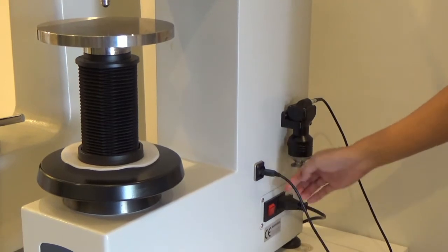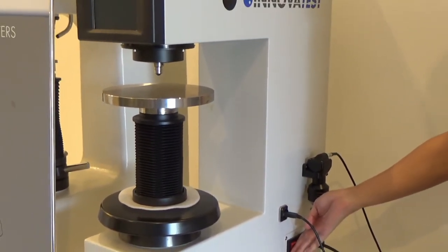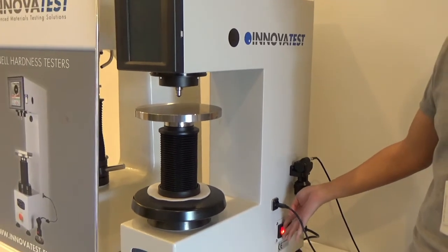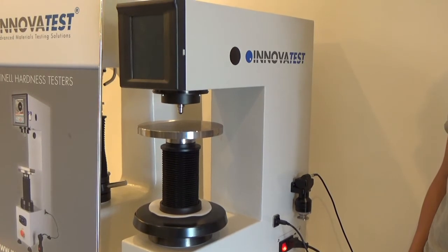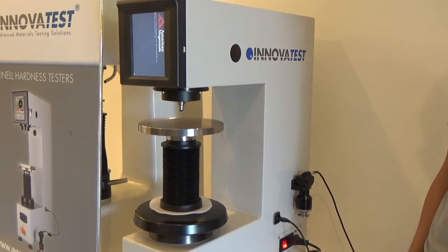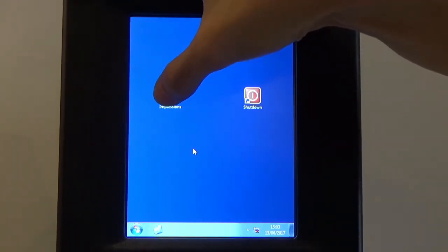The power switch will be here and we will turn on this machine now. This 3200 comes with Impressions software from Innova Test preloaded inside, so now we are going to start this software.